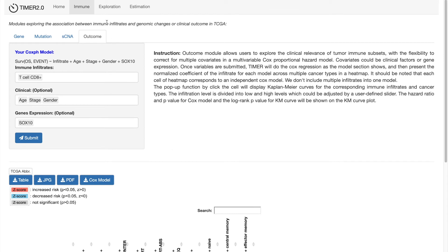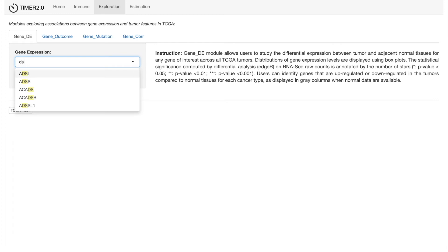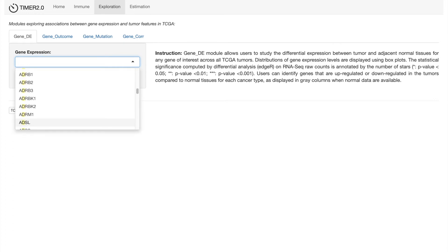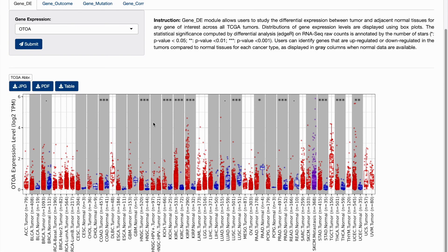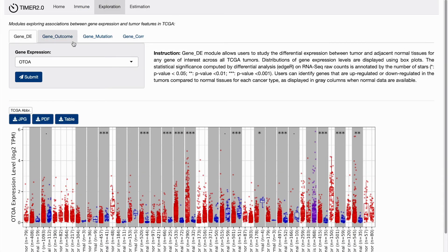Furthermore, TIMER2 has several modules for investigating non-immune related associations between tumor features in TCGA cohorts, found in the exploration component. For example, you can check differential gene expression between tumor and normal samples. Using a cancer testis gene, OTOA, as an example, TIMER2 outputs several box plots where red represents tumor samples and blue represents normal samples. We can see this cancer testis gene is significantly higher in tumor samples, consistent with the characteristic of cancer testis genes.